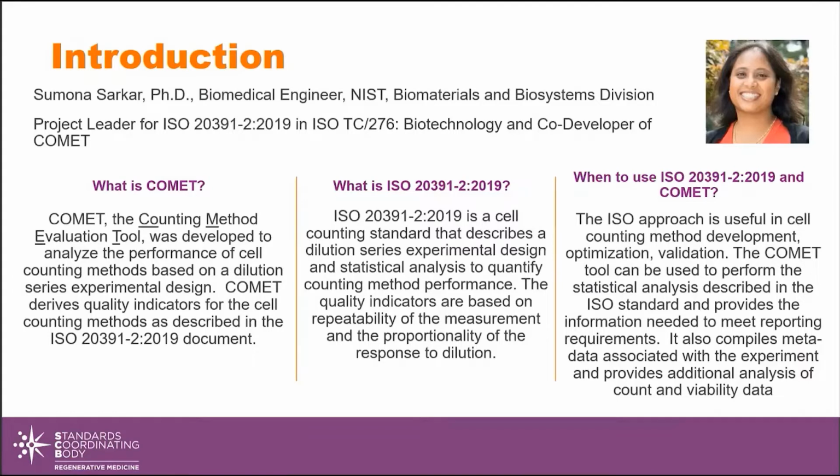It's mostly applicable when you don't have access to a reference material that can establish true accuracy of a method. And these quality indicators are based on the principles of repeatability of a measurement, as well as proportionality of the response to dilution. You can learn more about that standard at the ISO website, as well as our NIST website, and we'll give you some resources for that. So this ISO approach is very useful in counting method development, optimization, and validation and qualification.